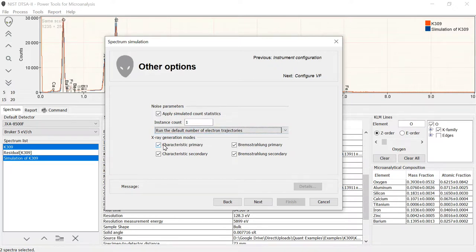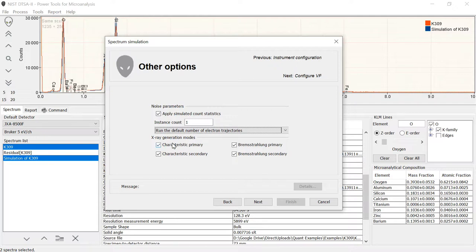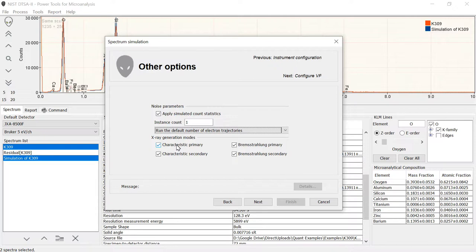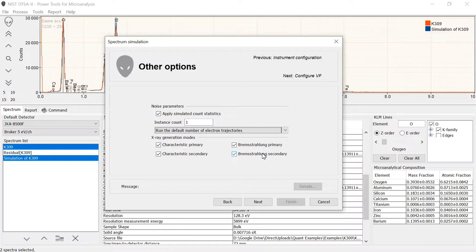And then I can select X-ray generation modes. This is one of the neat things about modeling is that you can turn on and off physics. So I can select which modes I want to simulate. I'm going to select all of them here, which is characteristic primary. So these are the characteristic X-rays that we see in the peaks. Characteristic secondary are the intensity in the peaks due to secondary fluorescence, Bremsstrahlung primary, and then Bremsstrahlung secondary. So turning on and off physics can be useful for learning how these various different effects influence what we measure.